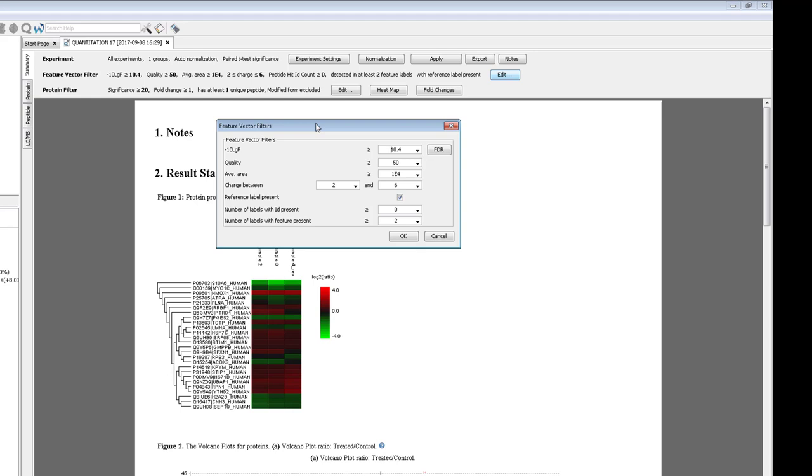Here, we have some filters based on peptide details that have been found to produce more reliable quantification results. The top is the minus 10 log P of the identification result, set to 1% FDR. It's best to make sure only well-identified peptides are used for quantification. The second is quality, which calculates the reproducibility of the peptide feature between the different labels. It considers features such as the isotope intensity profile, elution profile, and mass shift.